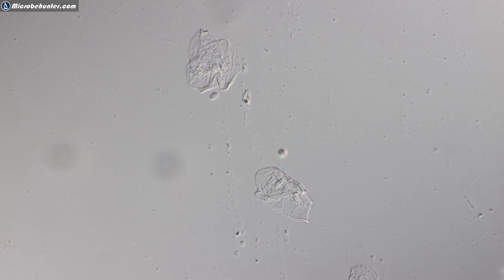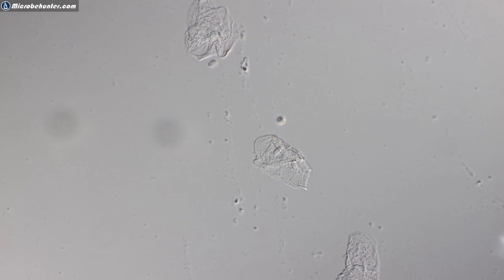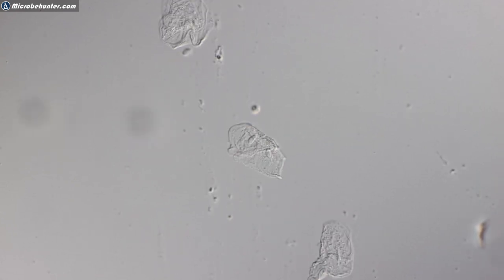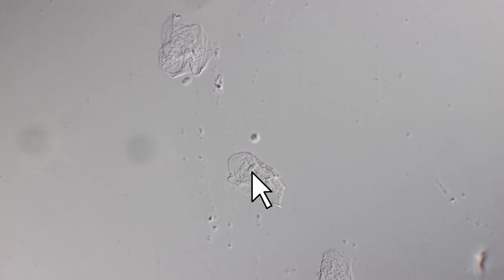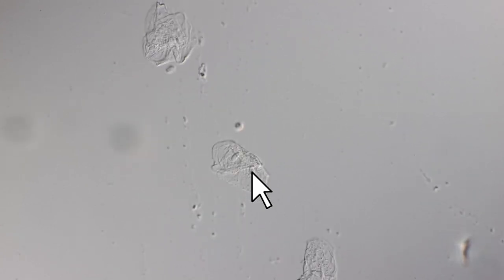However, this of course does not mean that this is the actual shape of the cell. It gives a three-dimensional impression, but this impression does not reflect the actual three-dimensional nature. But especially on the bottom one here, the one that's right now in the center, you can actually see two nuclei. These are actually two different cells sticking together. So you see over here, that is one nucleus. And right next to it, this is another nucleus. So there are two cells sticking together.